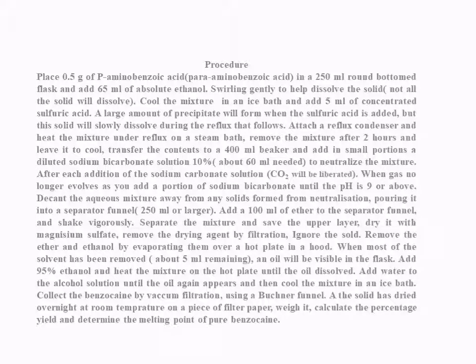When no gas evolves as you add a portion of sodium bicarbonate, stop the addition process. Check the pH of your mixture; it should be 9 or over.